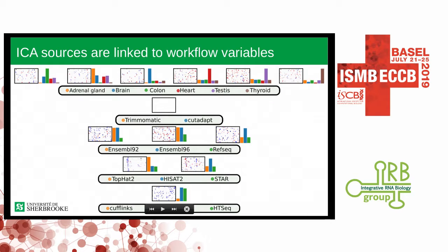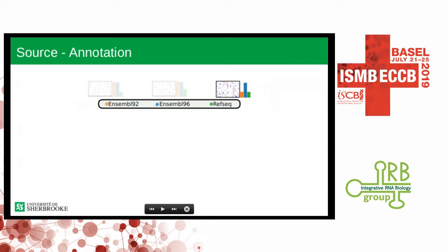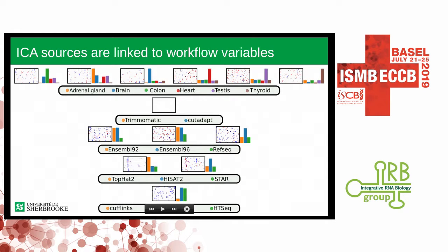These ones are sources that actually correlate with technical steps in RNA-seq, mainly the annotation, the alignment, and the quantification. Oh, well, this label is not supposed to be there. And for the remainder of the presentation, we'll be interested in this one.